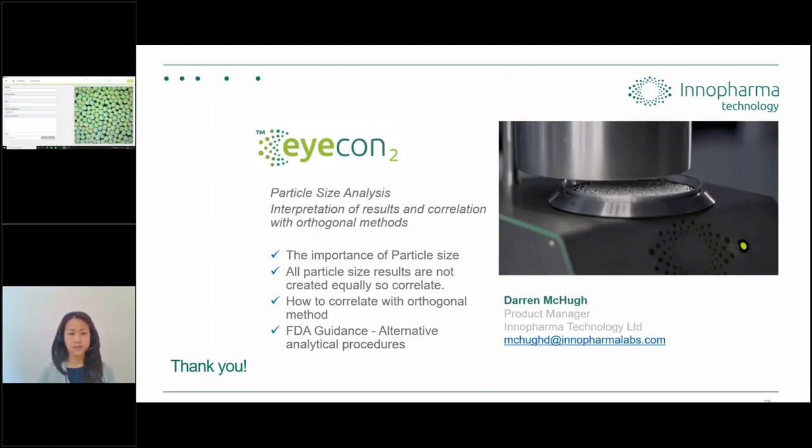With this inset here, you can see it. We have the benchtop that I showed you earlier. We're looking at some cellets here. They're not sitting on top of each other. This is purely because of the static image analysis, where the stage will move, stop, and the camera takes a single image and analyzes it. It's not so critical for dynamic image analysis, which is what we use for our inline settings, which is what you're seeing here happening with the GPCG-2 on the coating process.